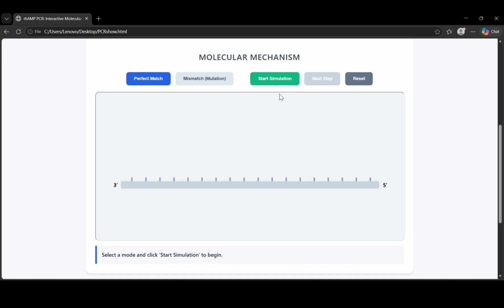However, if the target contains a mismatch, the hybrid structure becomes less stable and hence enzymatic processing does not occur, and amplification efficiency gradually decreases, reducing the likelihood of false positive signal generation. You can understand this in a simple way: the enzymatic processing will not occur and the blocking region will stay there, and hence amplification will not take place at that point.